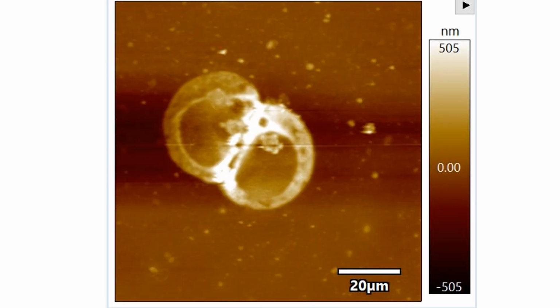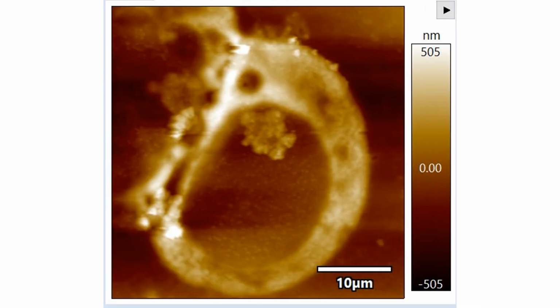So getting back into the images of some AFM data here, currently we're looking at height images. So again, false color, the lighter regions correspond to higher areas of the sample, darker to lower. So this is the top-down view of cancer cells, 2 cancer cells together there. That's a project that we're working on with a group out of Rockville.